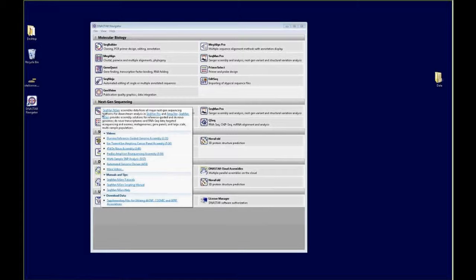Okay. And same with the Sanger data. If you're doing a combination of Sanger and next-gen, that would all stem from SeqMan NGen as well. But your analysis, I'm sorry to cut you off, Sharon. The analysis would be very similar to what I've shown today using the tools in SeqMan Pro. All right, thanks for clarifying that.